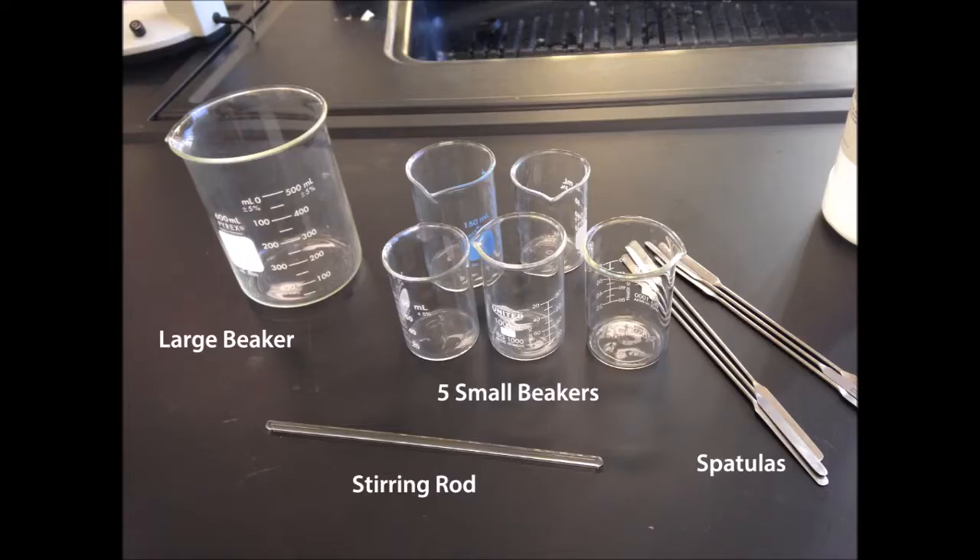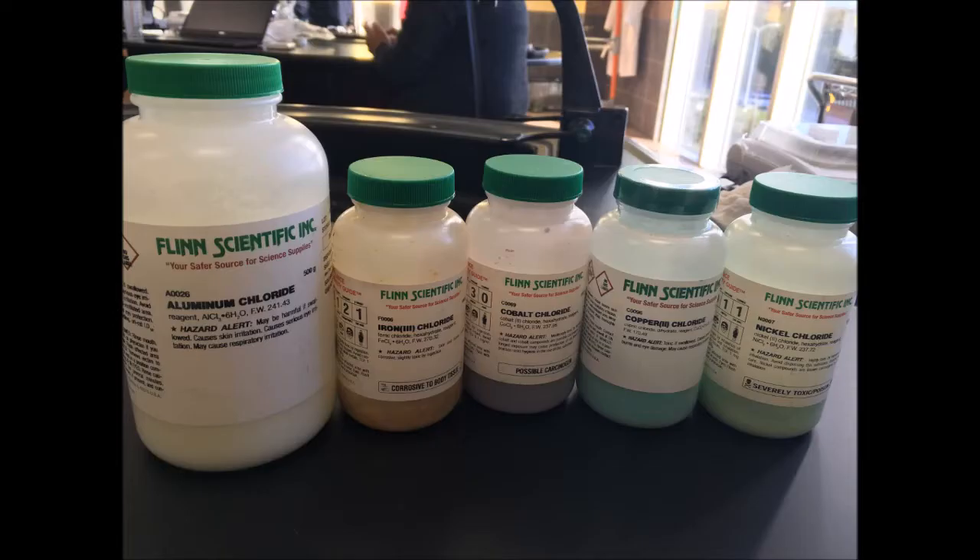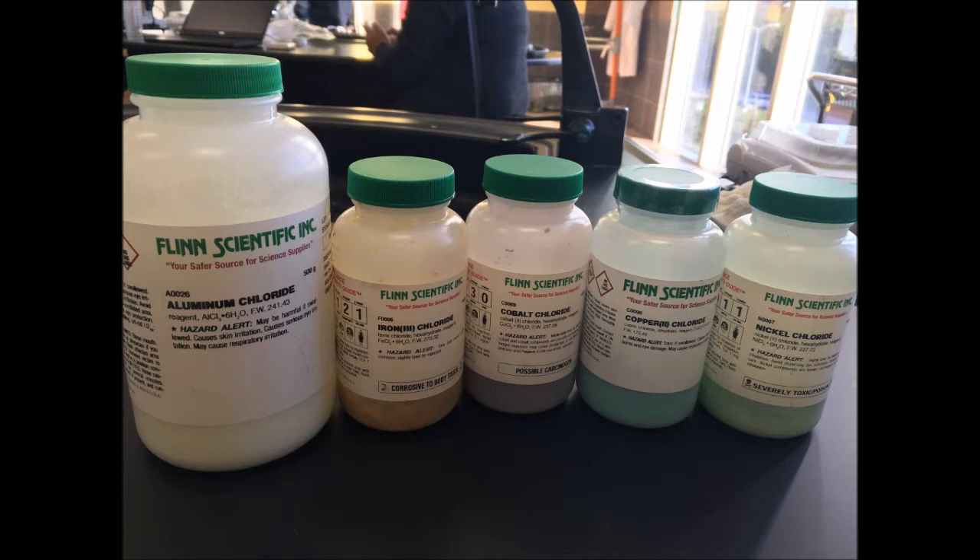Our materials include spatulas, a stirring rod, a large beaker, and five smaller beakers. We also used sodium silicate solution, also known as water glass. As for our metal crystals, we used aluminum chloride, iron 3 chloride, cobalt chloride, copper chloride, and nickel chloride respectively.